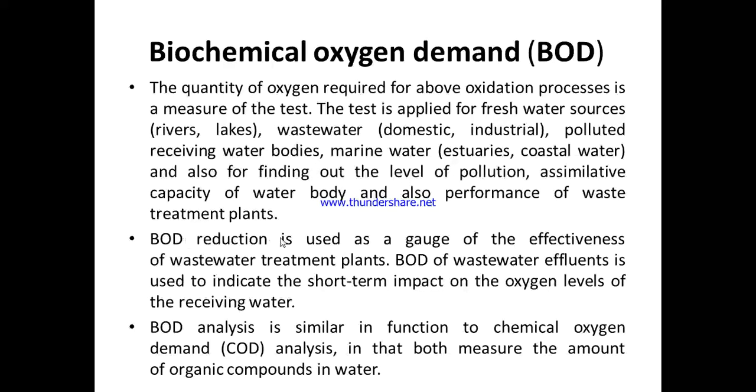बेसिकली BOD reduction is used as a gauge or as a measurement of the effectiveness of water treatment plants. Water treatment plant कितना effective है? That depends on the capacity of that water treatment plant in reducing, in decreasing the BOD level. Okay, BOD of wastewater effluents is used to indicate the short-term impact on the oxygen levels of receiving water. पानी में जो है अगर BOD हाई है, इसका मतलब वो बहुत ज़्यादा पोल्यूटेड है, and that will consume huge quantity of dissolved oxygen. So the aquatic organisms are going to be in threat if the BOD level are high.